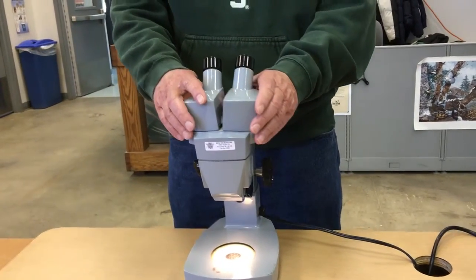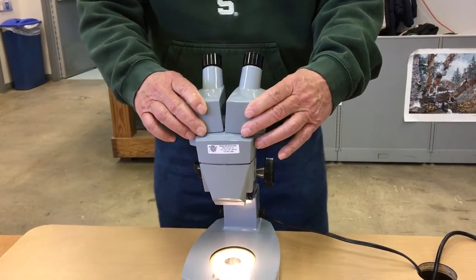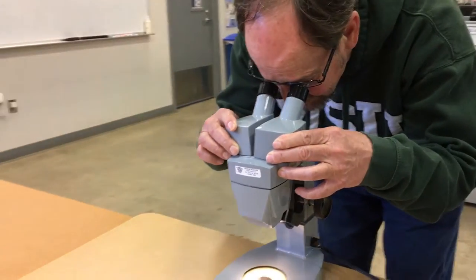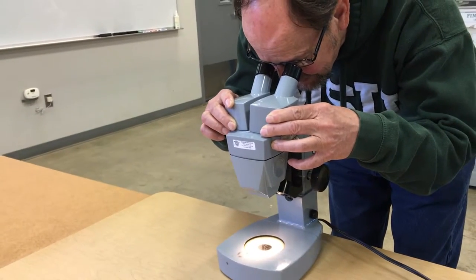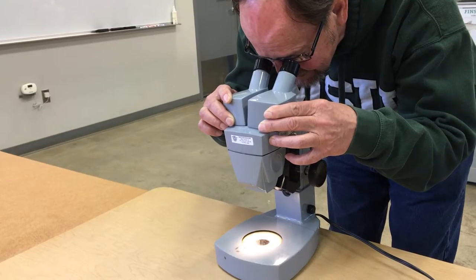These are called binocular microscopes and they have adjustable eyepieces, so everybody's eyes are a little bit different. You can move those so you can look through both of your eyes at the same time.